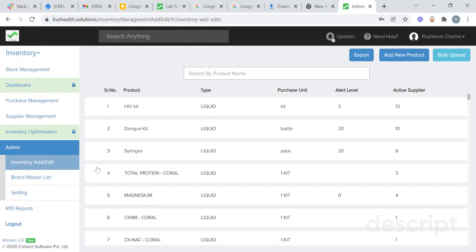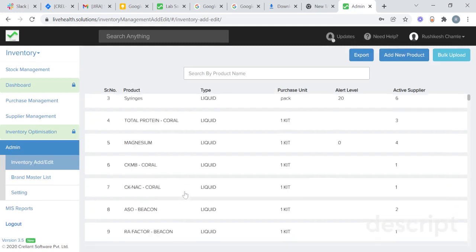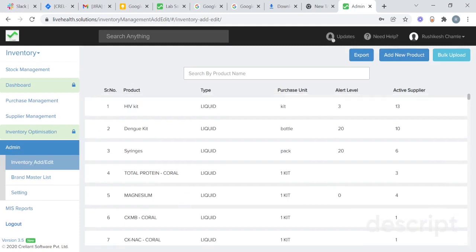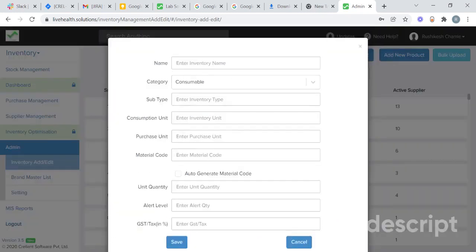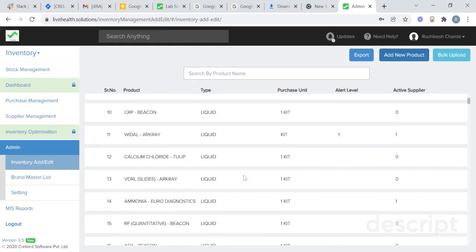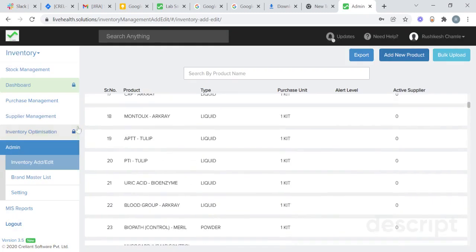In admin, under inventory add or edit, you will get all your inventory master list. You will also be able to add a new product from add new product. Add the name of the product, their subtype, consumption and purchase unit, and click on save. That product will be added to this list.